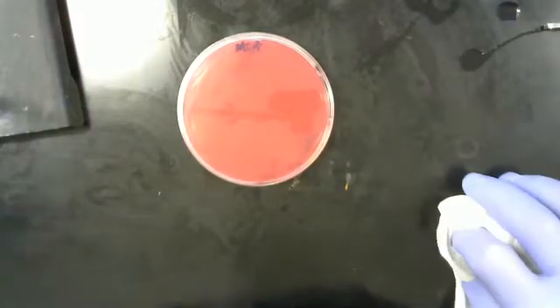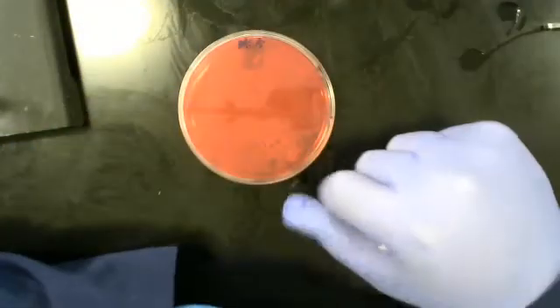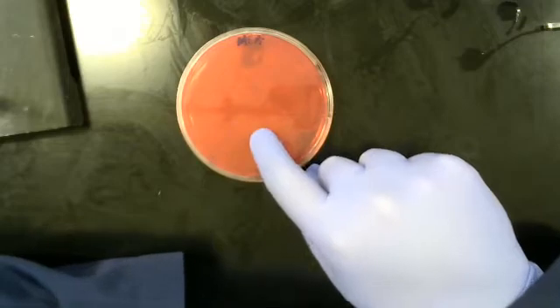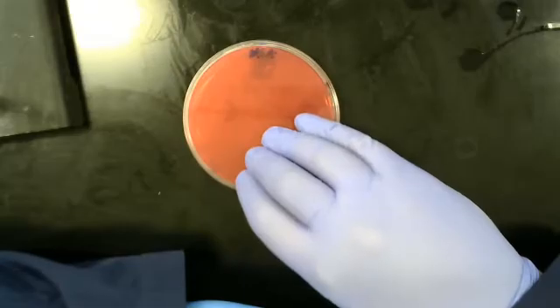The next thing that we're going to go over is our labeling procedures. Labeling is very important because labeling shows you what the bacteria is, what the media is, who owns the media, and when it was inoculated.